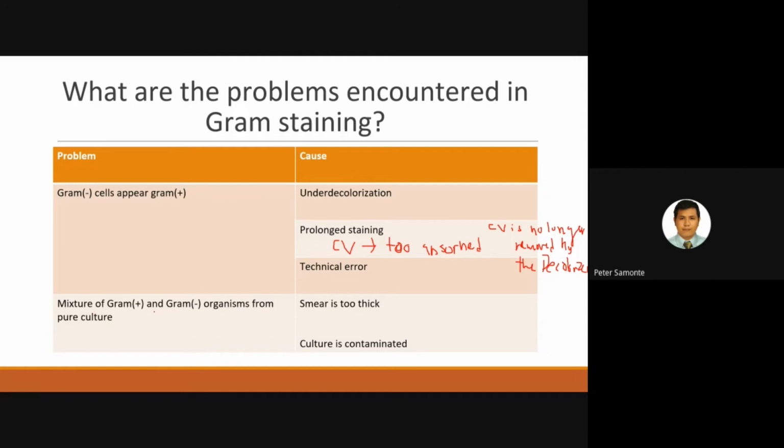Mixture of gram-positive and gram-negative organisms from pure culture. So this could happen if the smear is too thick or your culture is contaminated. So that is why it is very important, class, to practice aseptic technique. Question.